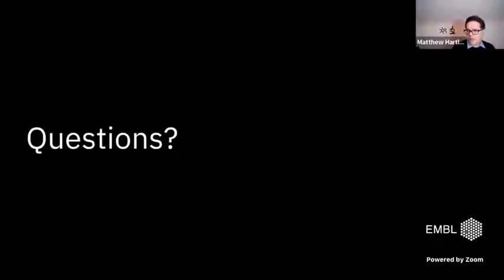And the two other questions I think we have open, I did briefly cover, but again, we do have an existing API that really comes from the lower level BioStudies, but we are building something that's a little bit more image specific. And from our end, there isn't a human review curation process. There's automated validation of data and metadata, but there's no curation queue that's required in order to unlock the images.